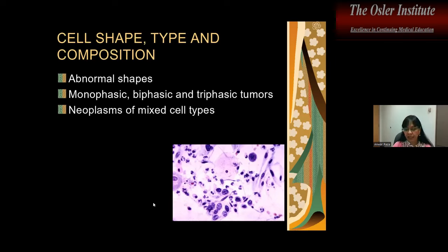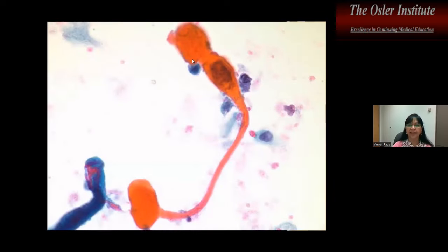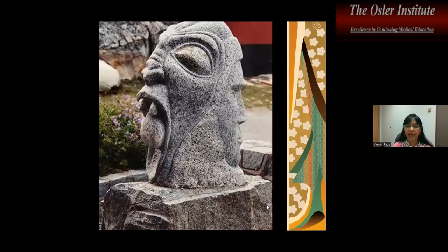So squamous cell carcinoma has this dirty clinging necrosis, very, very dark nuclear chromatin, so-called India ink nuclei. And you're going to have very abnormal shapes, as you can see, the sort of pencil-like shapes, as well as kite-shaped cells, and on a Pap stain, you get this orangophilia, as you can see here. So this is an example of squamous cell carcinoma.